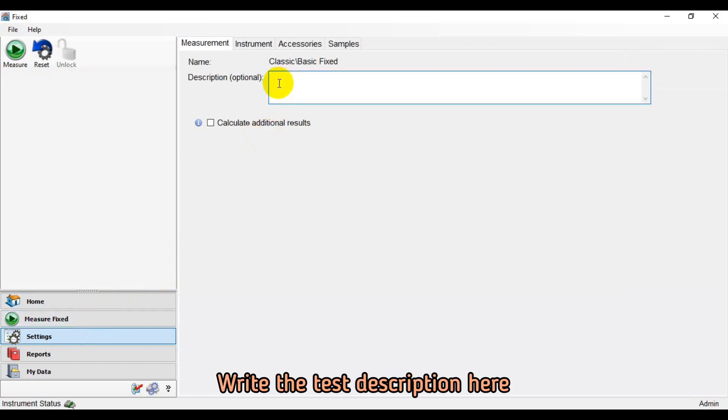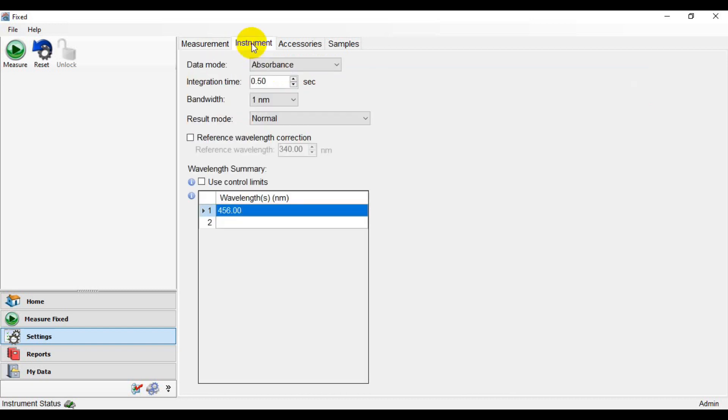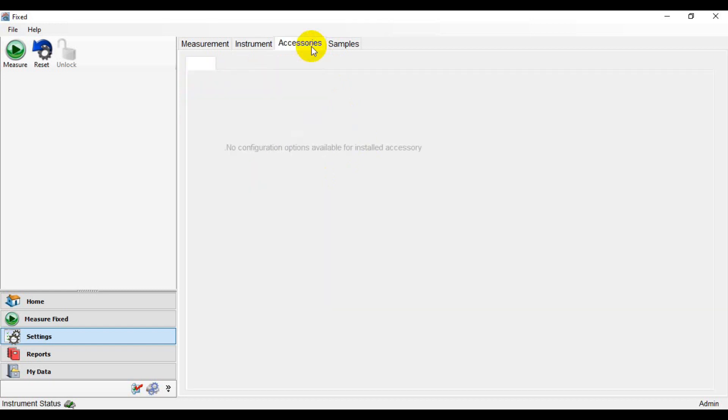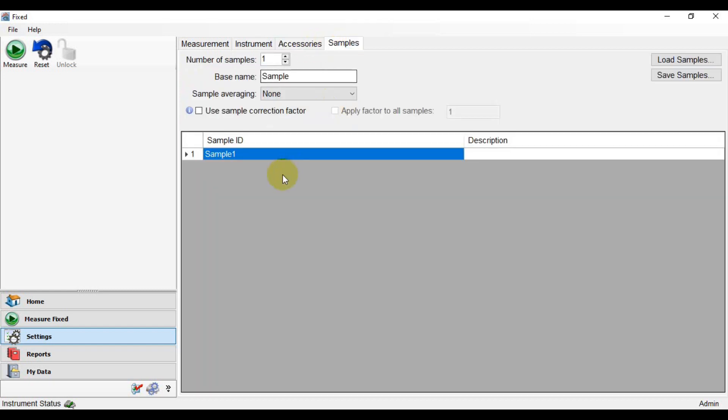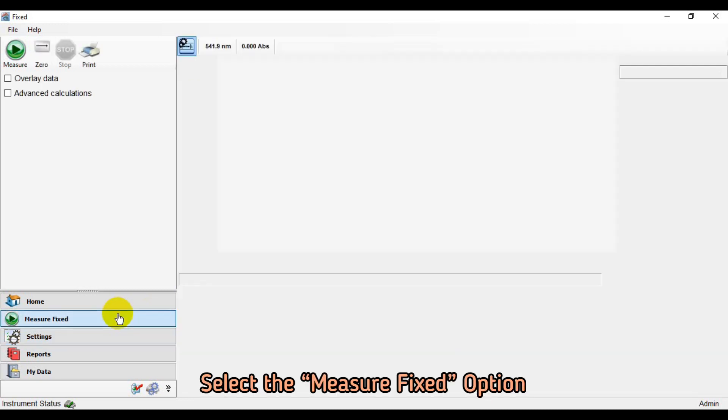Write the test description here. Now select the UV wavelength at 315 nm. Type the sample name here. Select the Measure Fixed option.